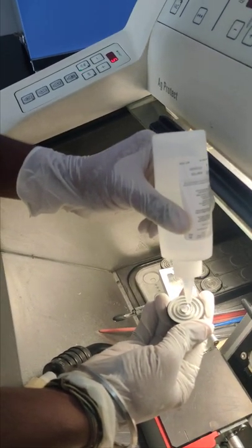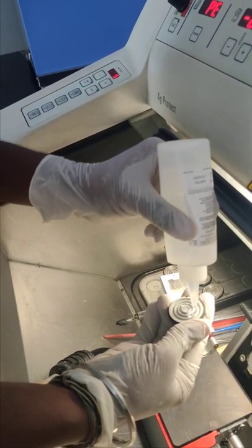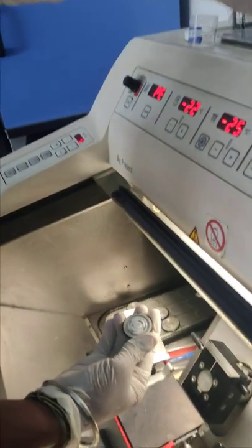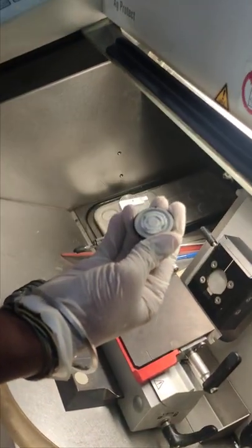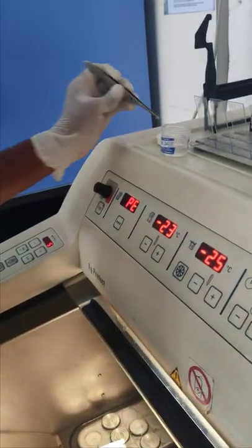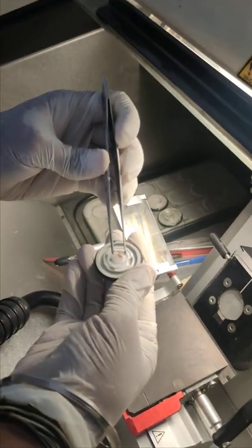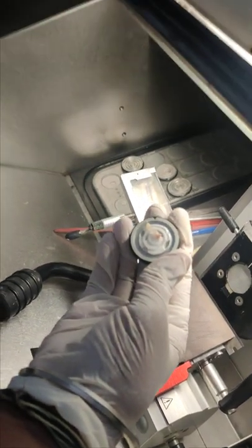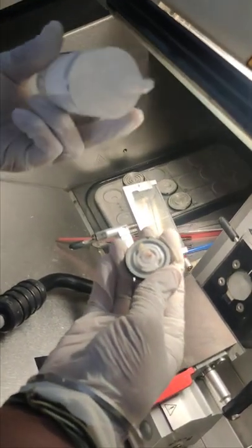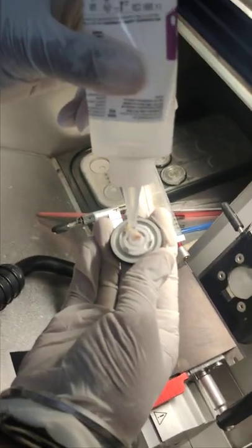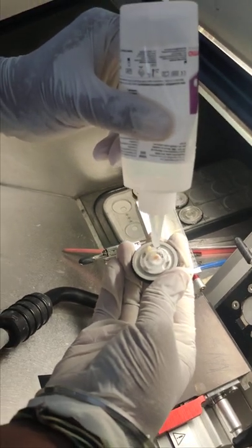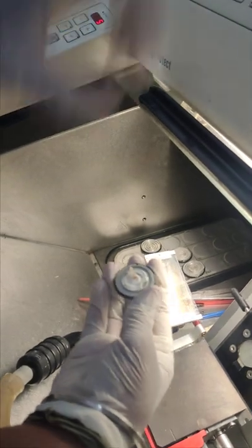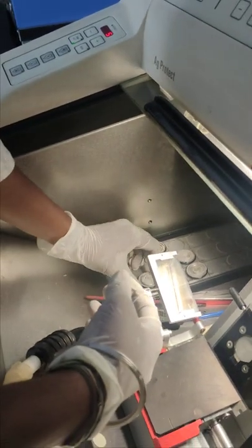We place cryomatrix gel over the check holder, then place the tissue over the gel. Once the tissue is placed, we cover it again with cryomatrix gel and wait for 5 to 10 minutes by placing it in the temperature control holder.